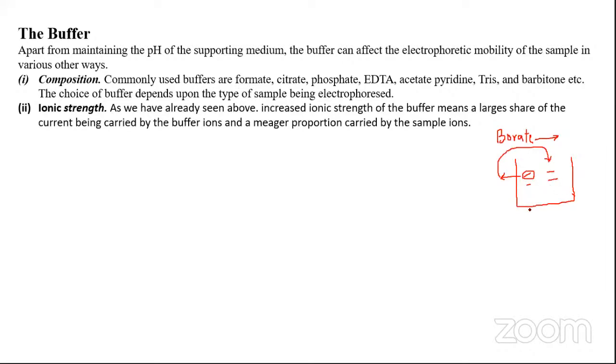Can you give any explanation? You got the situation, right? First, he used a BSA sample that was with him. He supposed that that BSA sample was pure enough. He subjected it to electrophoresis. He got 2 bands. So he thought that perhaps the BSA sample that he was using was not that pure. So he used one band. He purified BSA from one band and he electrophoresed it again. To his surprise, although he purified the BSA only from one band, he still got 2 bands. What could be the reason?